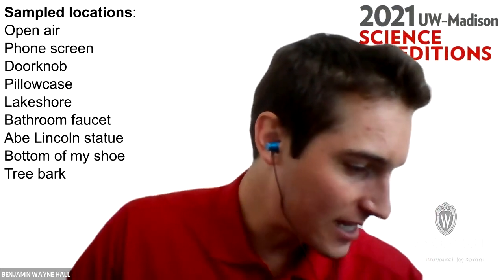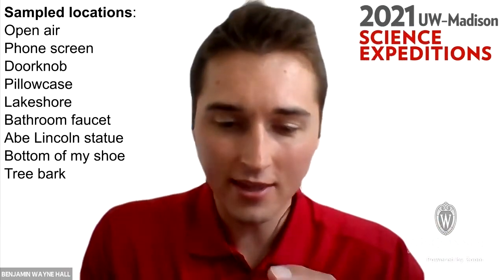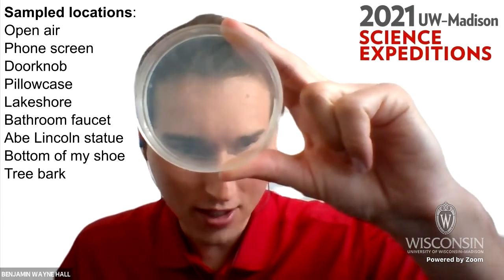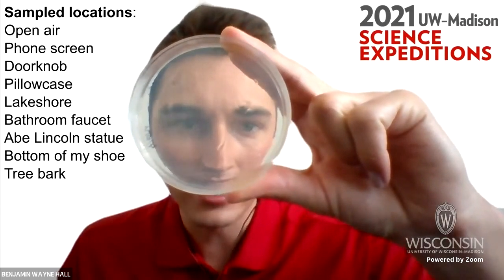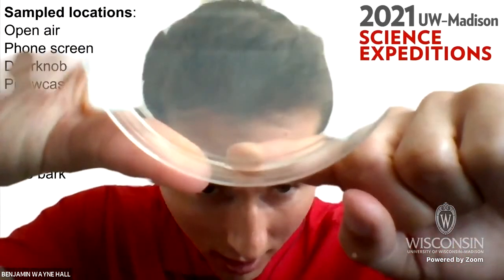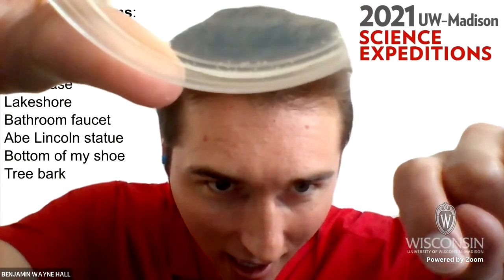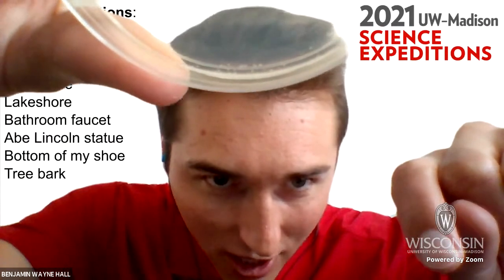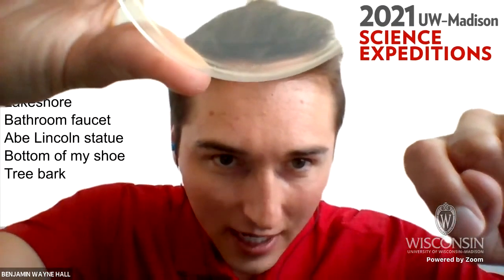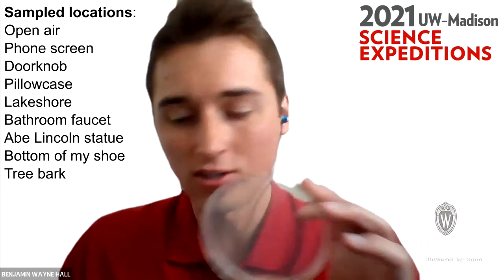So now let's go to some of the least examples. We can start with the open air. I think a couple people guessed this. And sure enough, it doesn't really look like I got any bacteria in the time I was sampling. There are a couple actually along the bottom edge. So you can barely see those tiny dots right along the edge there. So it seems like we might have actually gotten some bacteria out of the air, which is interesting, but it doesn't look like they're all over the plate.